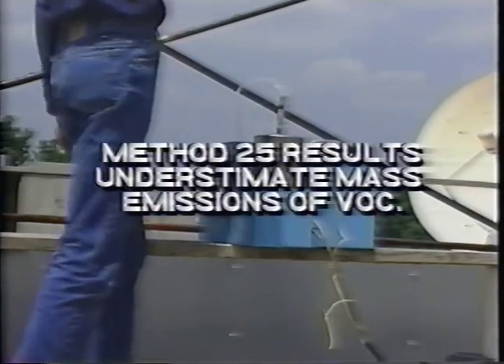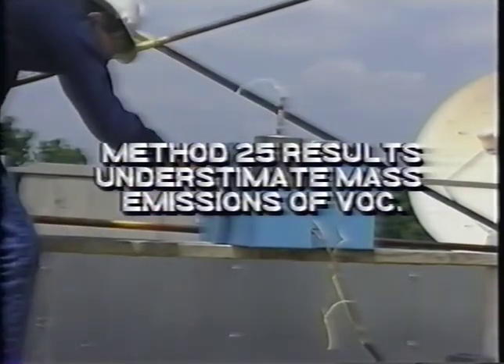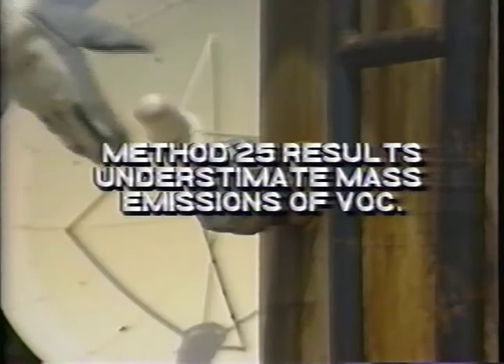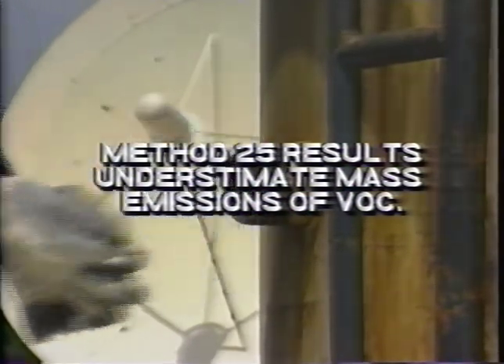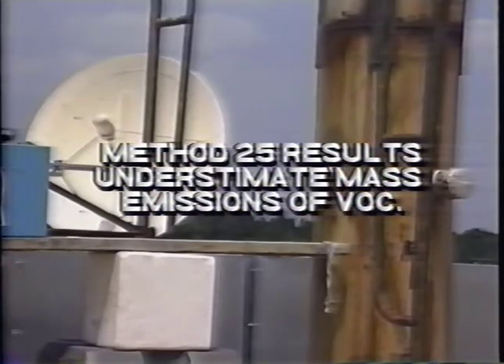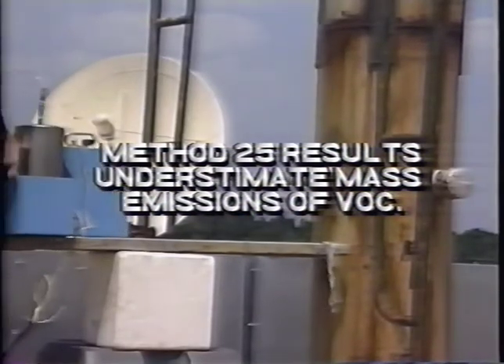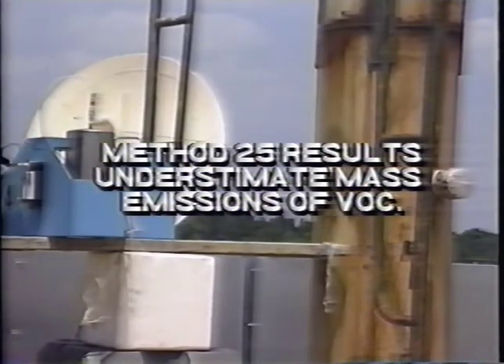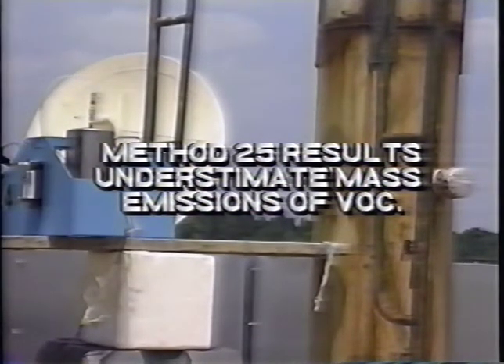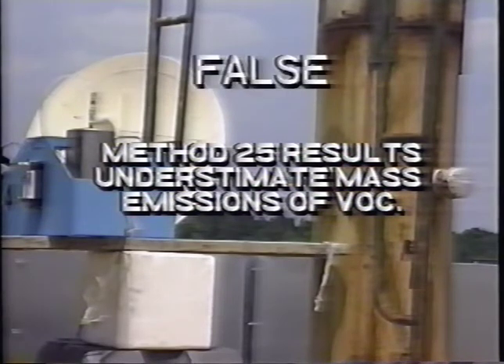Method 25 results will underestimate mass emissions of VOC because molecules containing elements other than carbon, such as chlorine or oxygen, have molecular weights greater than corresponding carbon-hydrogen compounds. But if the tester knows the composition of the gas, then the final results can be corrected to actual mass emission rates mathematically. Therefore, the correct answer to question 5 is false.